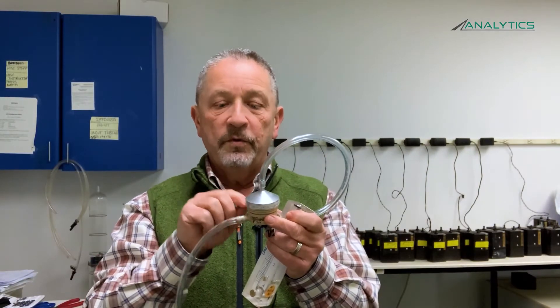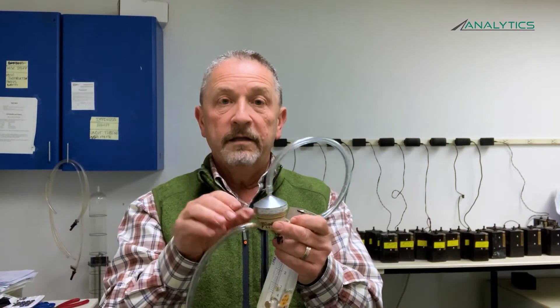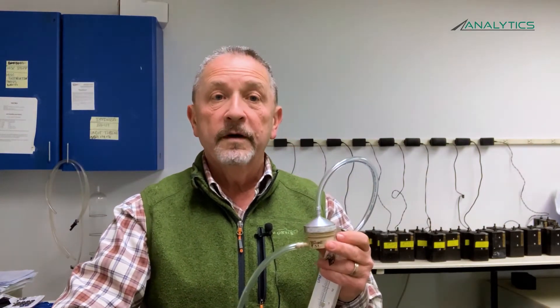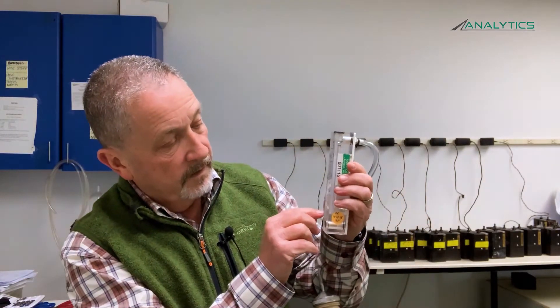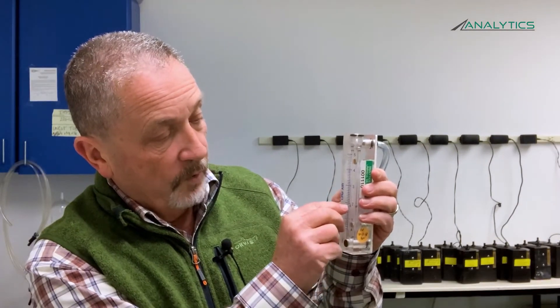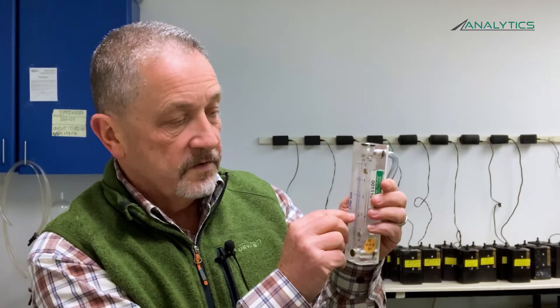If you get this setup from us, we'll have this already connected for you, so you won't have to do any of that work — the calibration adapter will be connected to your PPI. Turn your pump on and let it run for about 15 minutes before you check it. Then check your rotometer. For those who haven't used a rotometer before, it has a little ball that floats up and down based on the flow rate of the pump. Take your reading at the center of the ball — that's how we calibrate — and it should be reading right at two liters per minute.